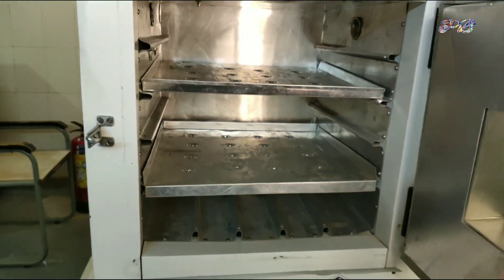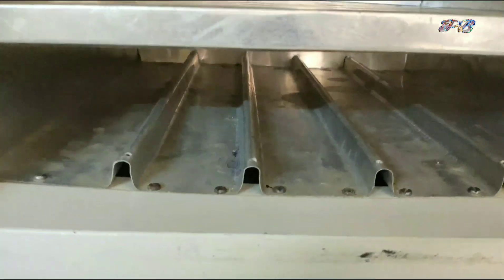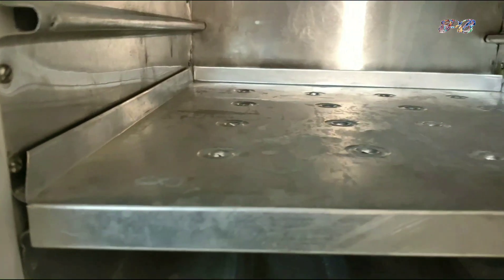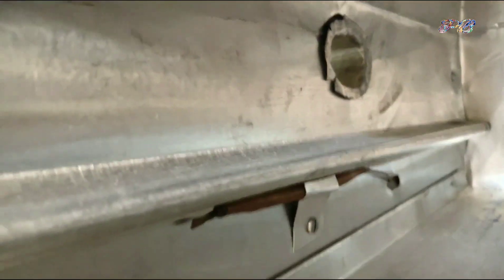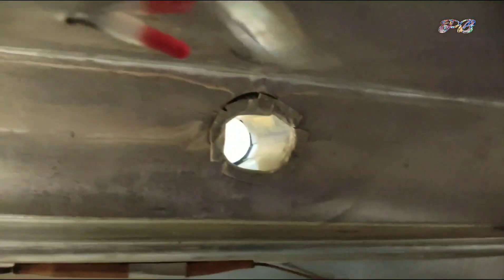This is a double-walled cabinet of mild steel, lined with insulating material. The inside door is made up of a glass panel set in a wooden frame and fitted with a gasket. The outer door is double-walled and made of mild steel. Adjustable shelves are of crimped wire mesh. The heating elements are fitted at the base of the incubator, arranged with an efficient thermostat. There is a ventilation arrangement to expel expanded inner air. The temperature can be controlled using a control knob and is recorded by a thermometer.